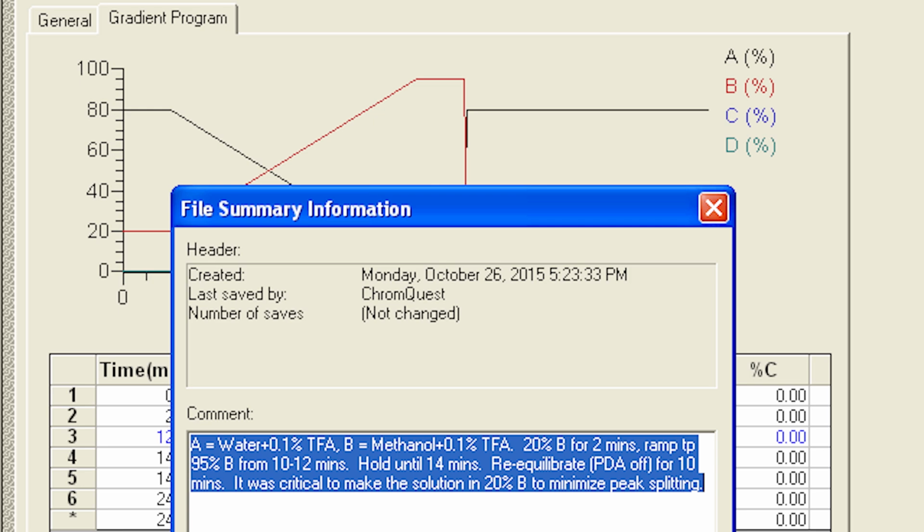So if you want to change your separation, if you're not getting peaks to separate, you want to start with the simplest thing first, and that is change your mobile phase. Change your percent mobile phase. That's very easy to change in the software, very easy to play with. It's like temperature in GC. So start there, and if you can't do that, then you have to start changing columns and things.